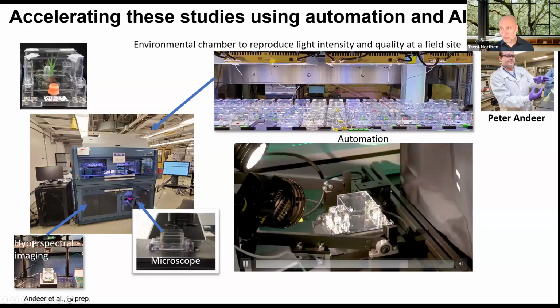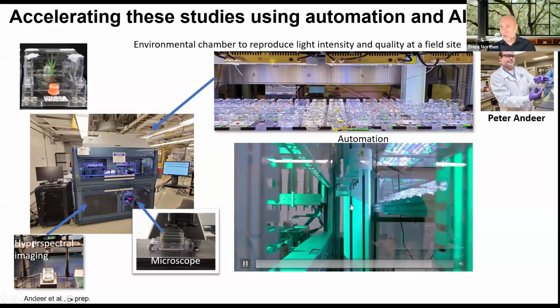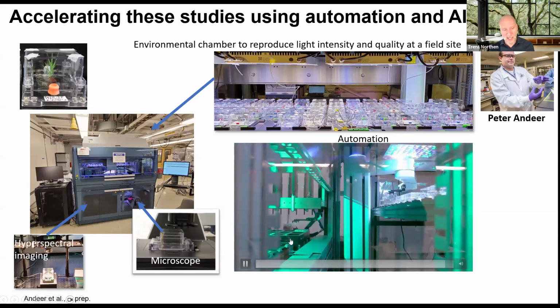And we are looking at 3 different views, so the top view, and then 2 different side views. So then you can estimate the size of the plant. And since you can do the imaging non-invasively, you can look at how the microbes are affecting the growth rate of the plant over time.